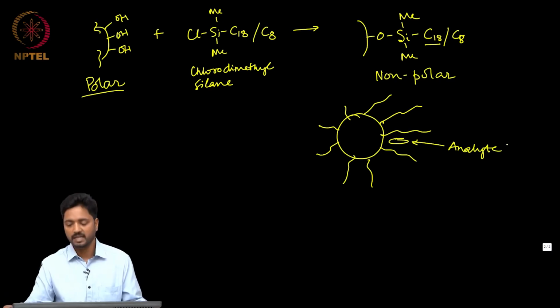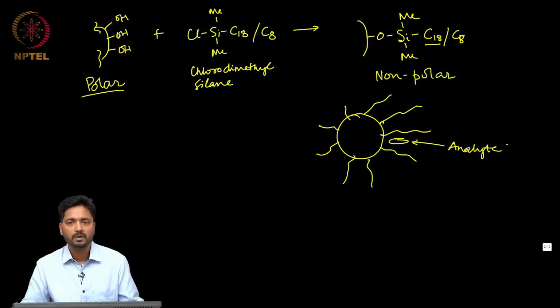So, if the analyte is also non-polar, it would like to partition well into this non-polar phase and will not elute out.